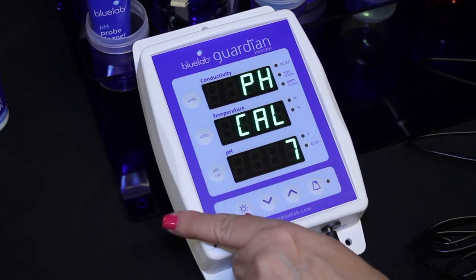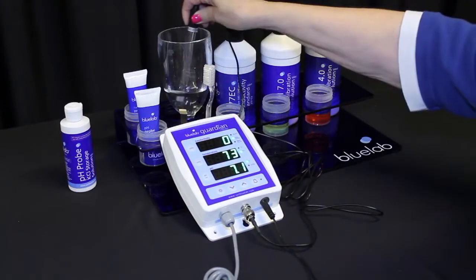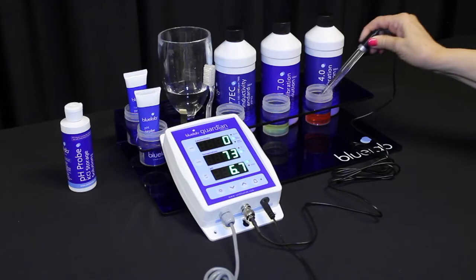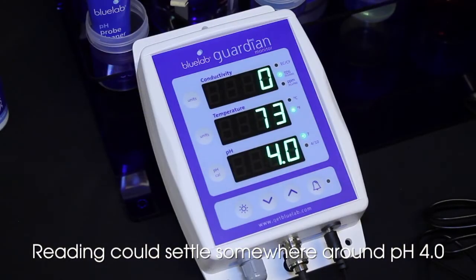Release the button. 7 will flash on the pH display, then the pH 7.0 indicator light will glow. Rinse the probe tip in clean tap water and place in pH 4.0 solution. Be patient and wait for the reading to stop — it may take a few minutes.